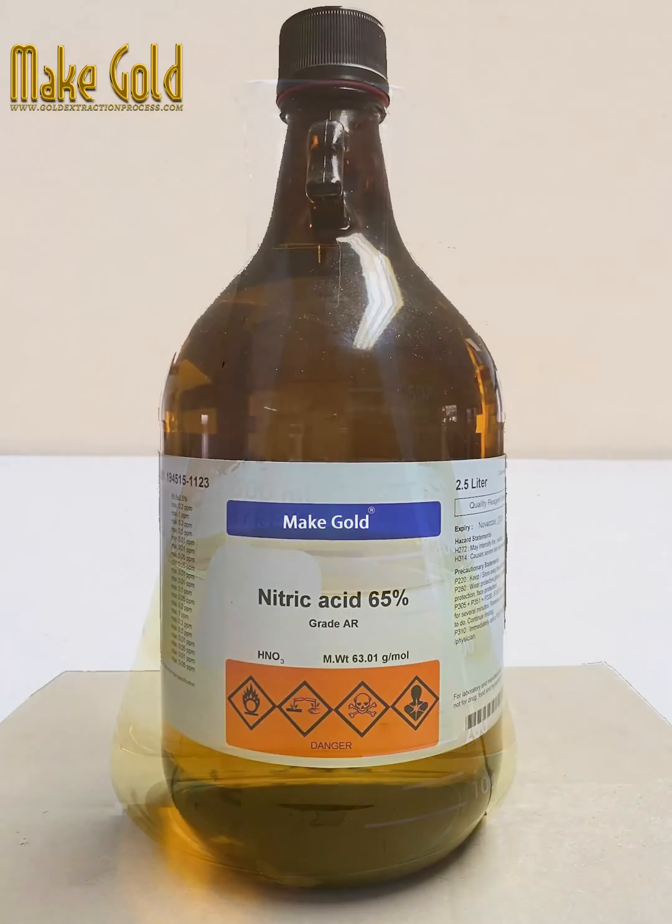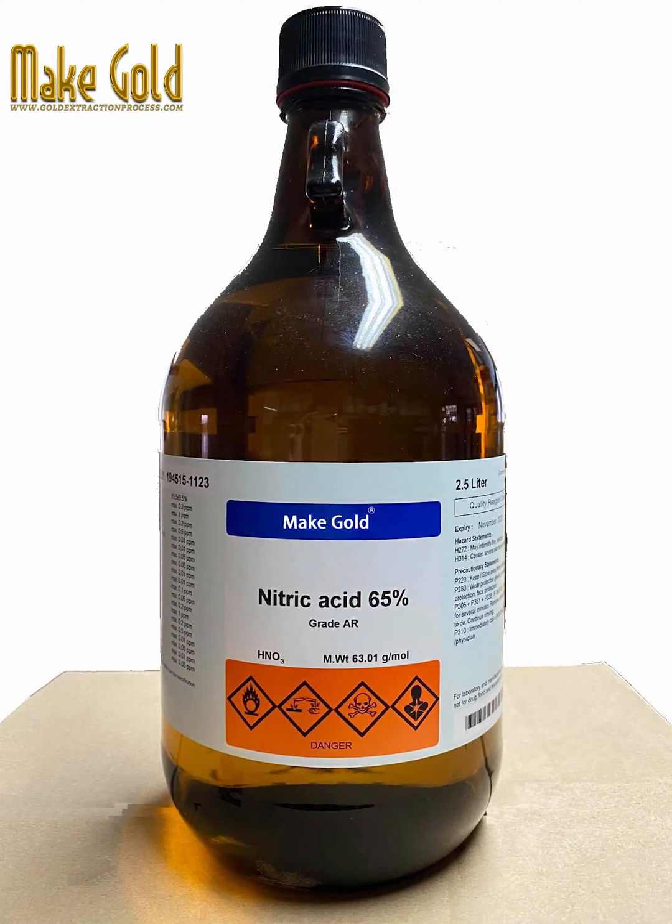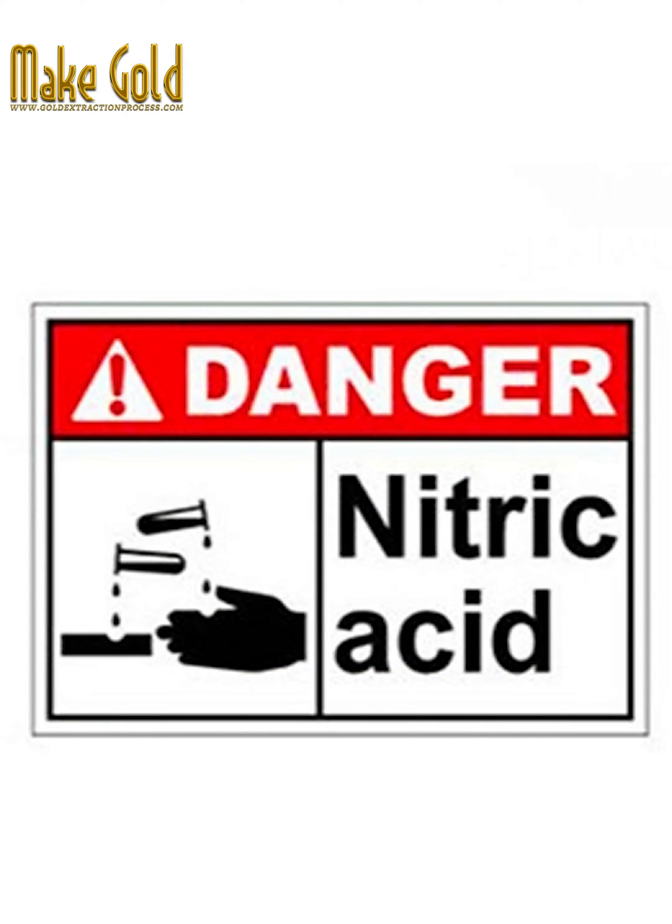Aqua Regia is a mixture of nitric acid and hydrochloric acid. The following are the general steps to make Aqua Regia.